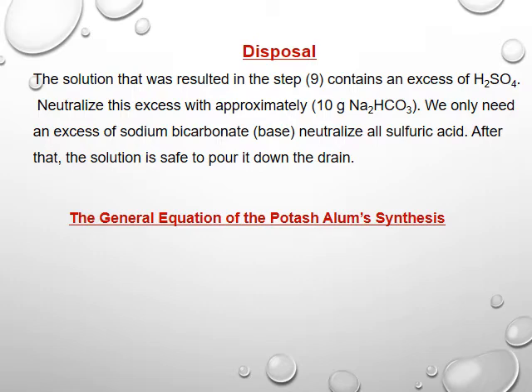Now for the disposal, we must get rid of all the stuff that we dealt with in the experiment, so we use neutralization.